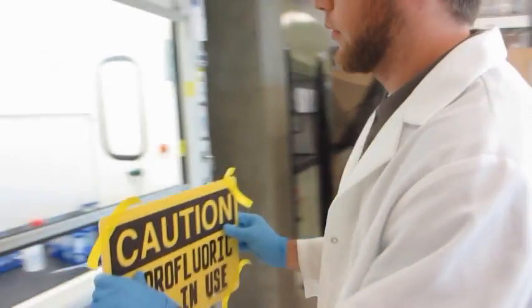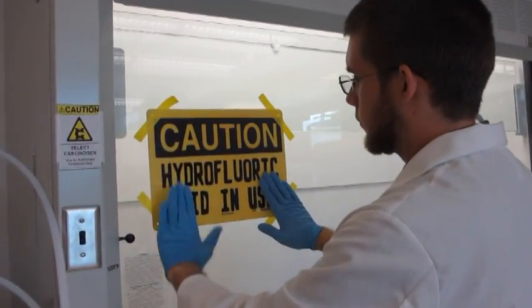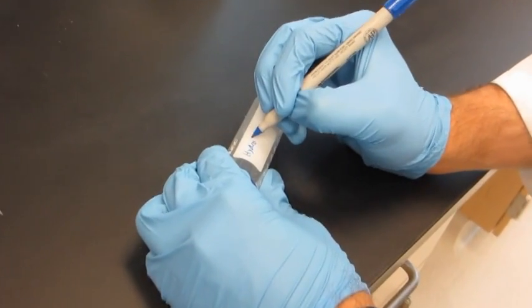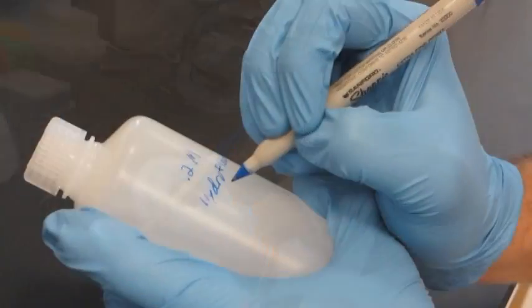Use the buddy system — that is, arrange for a partner to work with you. Post signs in designated areas to communicate appropriate warnings and precautions, and notify others, not just those working with you, that you're working with a hazardous chemical. Make sure to label containers with the correct chemical name. Abbreviations are not acceptable.